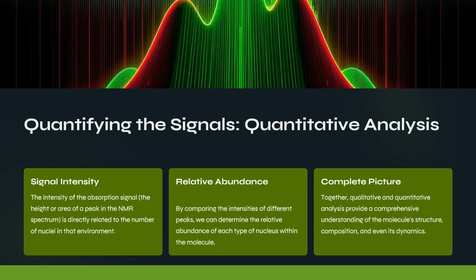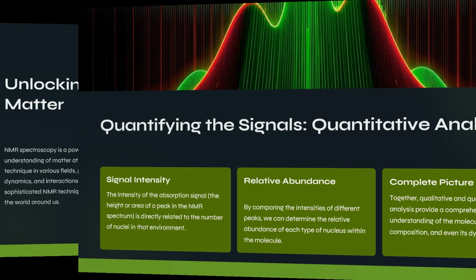When we combine both qualitative and quantitative analysis, we get a complete understanding of the molecule. We can determine its structure, composition, and even how its atoms move or interact with each other.